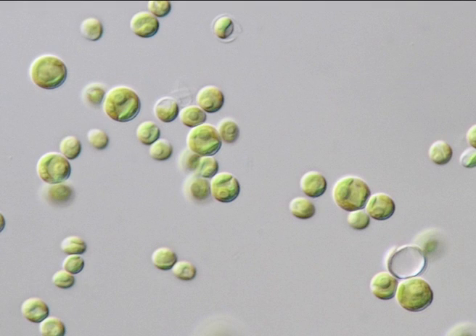Or, algae are emulsified directly in the staining solution and the emulsion is allowed to stand at room temperature for 15 to 20 minutes. A loopful of the emulsion is then removed from the top of the fluid and smeared with a circular motion upon a clean slide so that it dries quickly, leaving precipitated particles at the periphery of the drop. The slide is not heated. A 1% aqueous solution of safranin is now applied briefly and the smear is then washed with water and air dried. The slide is ready for observation under the microscope.